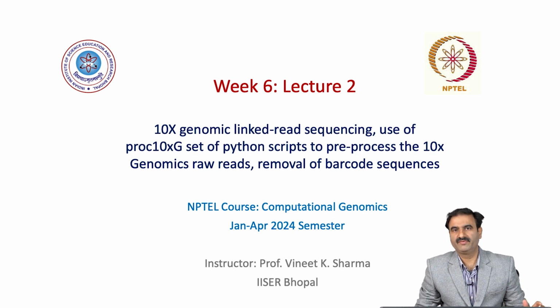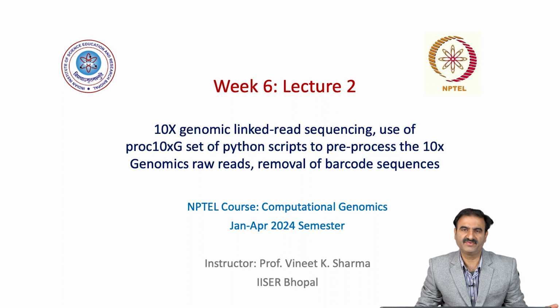So in this lecture we will look at the use of link reads and also how to generate them. Before going into link reads and their processing, and the other kinds of link reads such as the 10x Chromium or the Illumina TELL-Seq link reads, we will see what the significance of link reads is, and before that, why we need to generate these link reads.